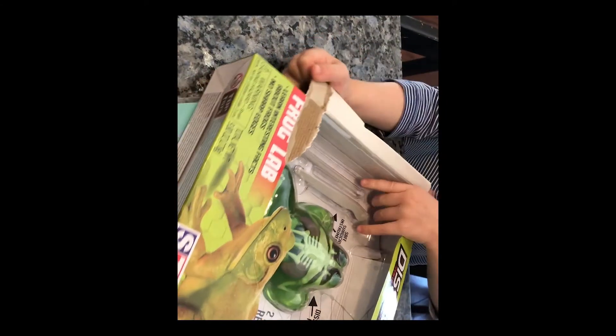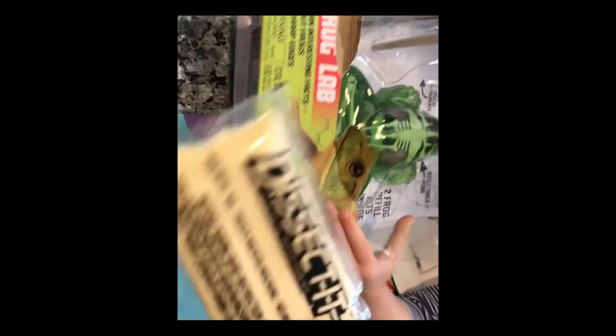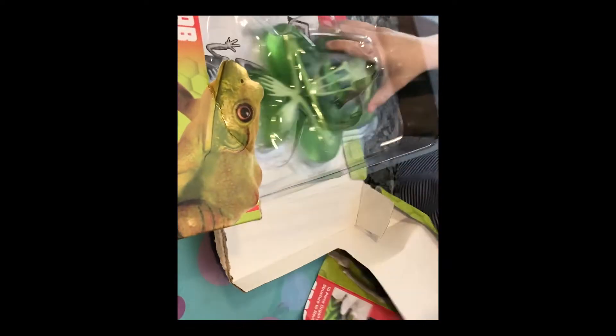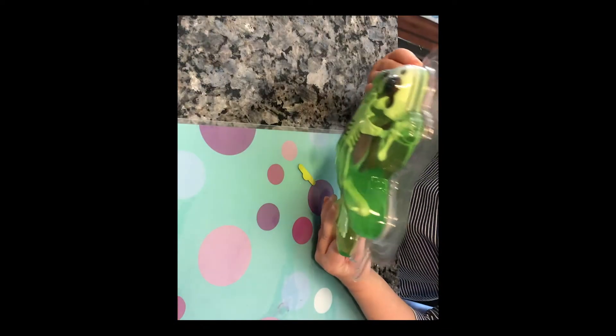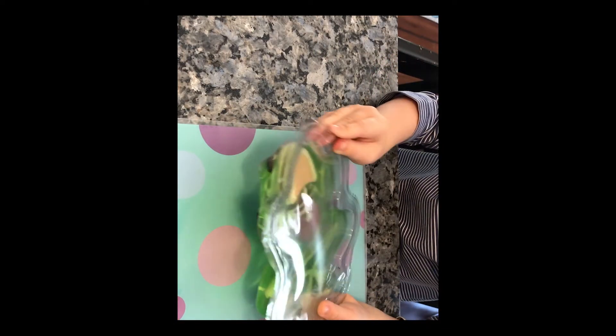Look mom, I'm opening it. Good job. I'm getting them down. Frog refill. You got frog refill mix? Got it out. Okay, we're going to dissect it. Frog lab. I think there's also slime in there. There's slime in there too. Seems like everything has slime in it these days.